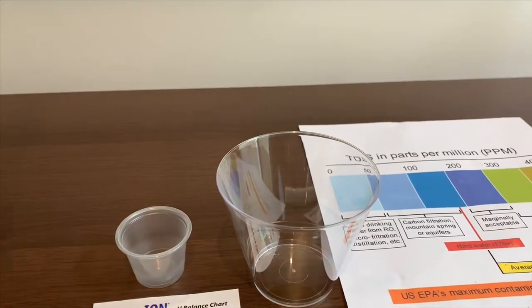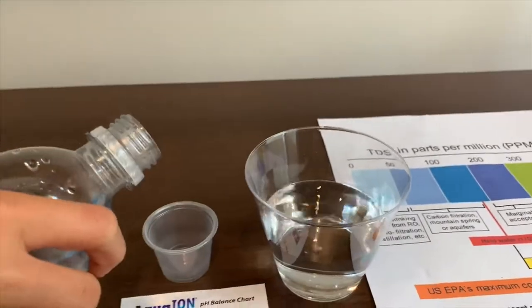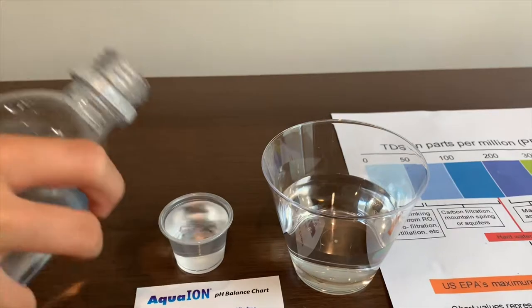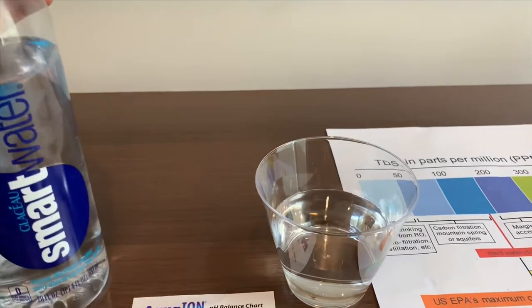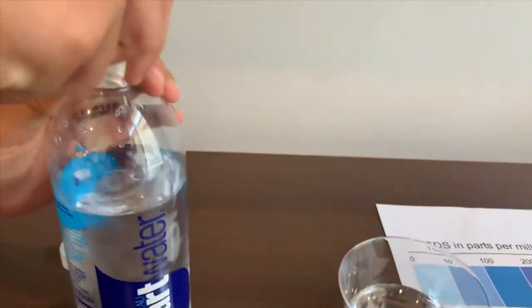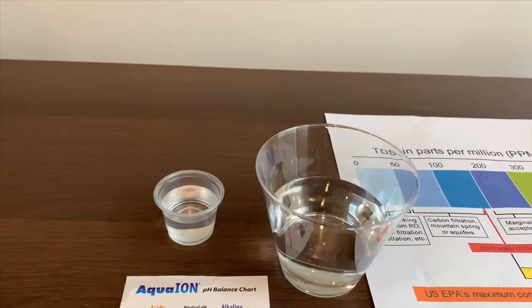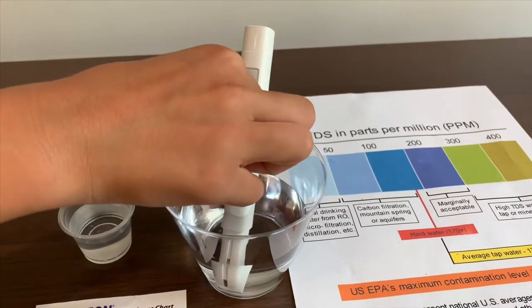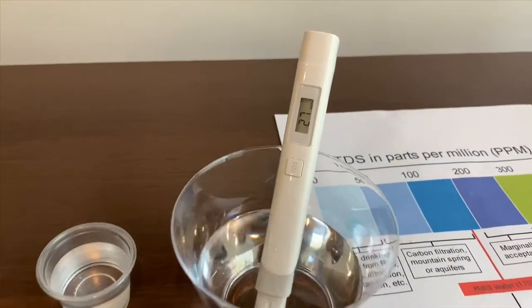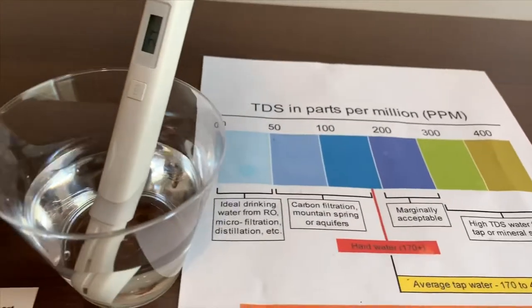Let's pour some in. This is a little too much, let's pour some out. Let's turn on the TDS tester. Make sure it says zero. Let's put it in. Twenty-seven. That is ideal drinking water.